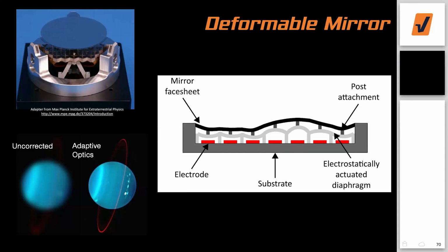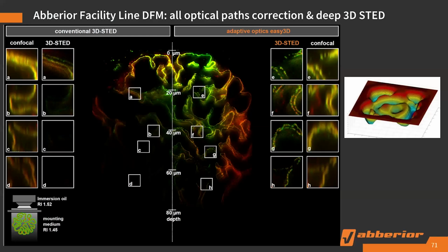With that adaptive optics, the deformable mirror, it's optical correction. There's no mathematical calculation. It's optical correction. You see a perfect image. We have exactly this, but a small version, in our microscope, and it can correct the optical distortion deep into the tissue.